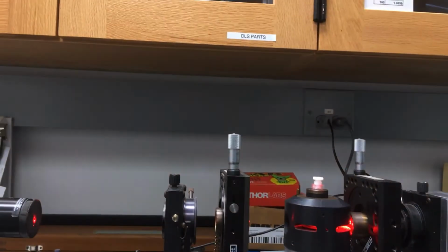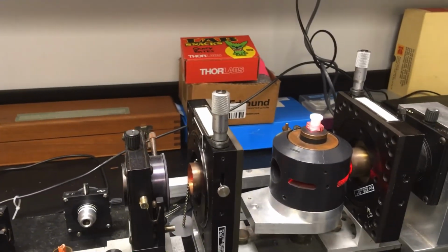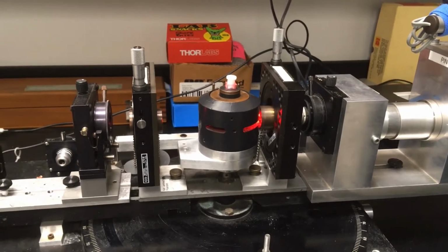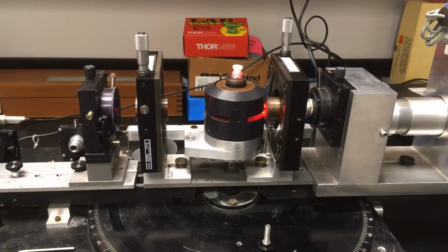Now, it turns out that these square fluorimeter cuvettes tend to be a little bit birefringent. And in this case, that provides a certain amount of light that is horizontally polarized, which is going to mix with the actual scattered light. So we'll have light that is generated basically by the glass in the cuvette mixing with the scattered light and depolarized scattered light, which is probably a pretty weak signal.